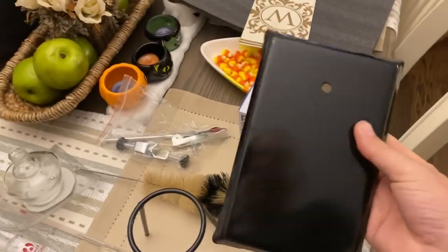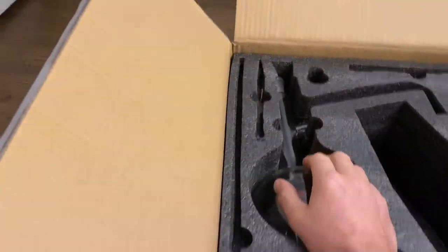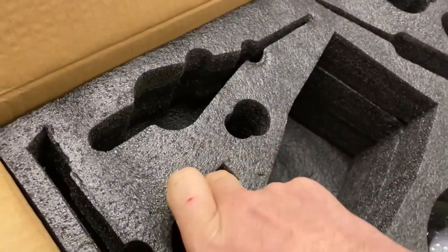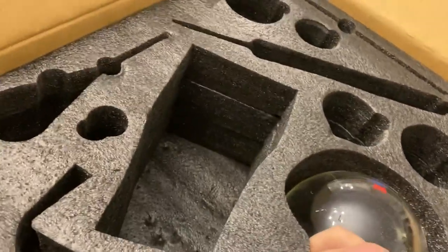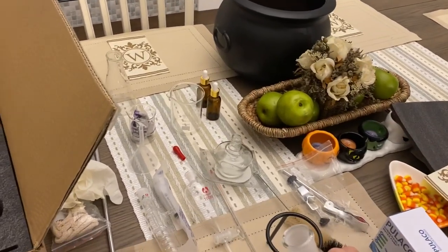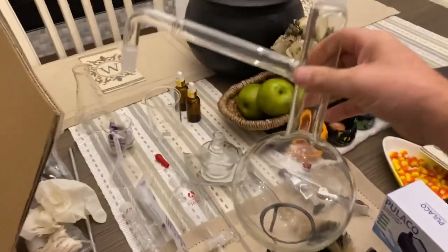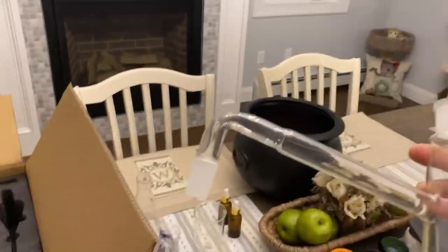The base tray is really heavy duty steel — it's powder coated, not painted, so it's very durable and solid. Now this one I'm a little scared to get out; it is a large piece and it's really in there. You've got to be real careful with this one. This is the main heating tank — your main item. It would be set up like this and feed into that part there. This is all solid, beautifully blown glass, and it's tapered for the stoppers — just absolutely beautiful equipment.